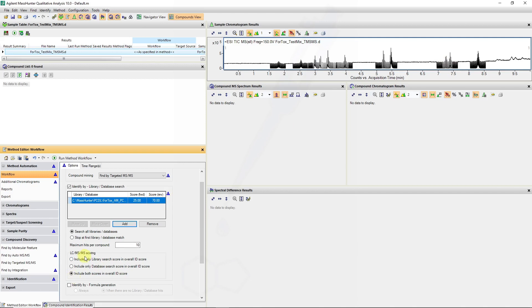In this case I'm going to only include the library search scores and the overall ID score, and you'll see why that's important when we have MS-MS data and interpreting the results.